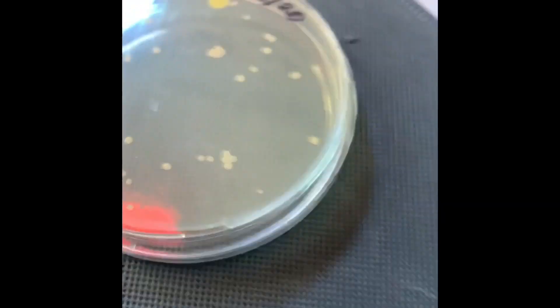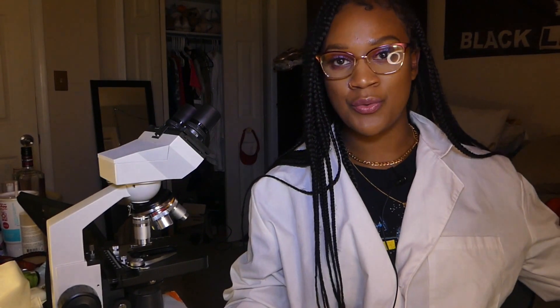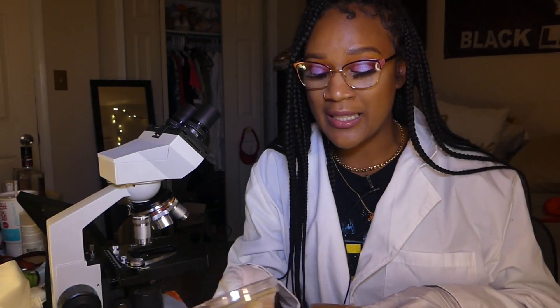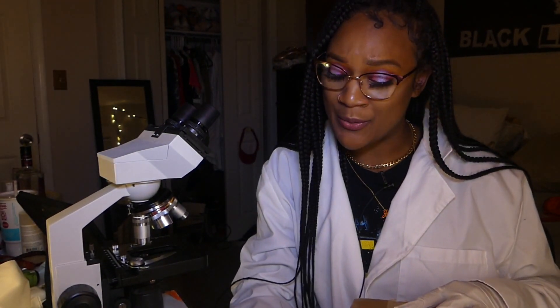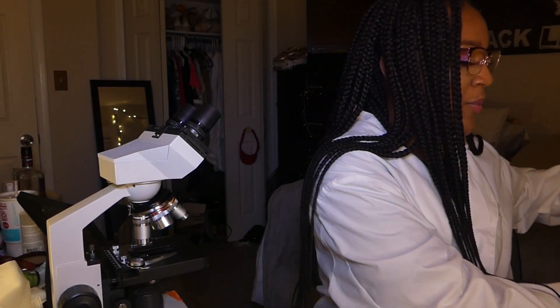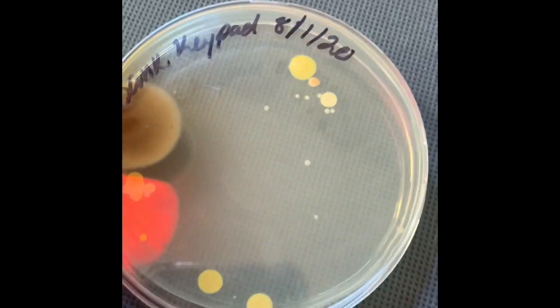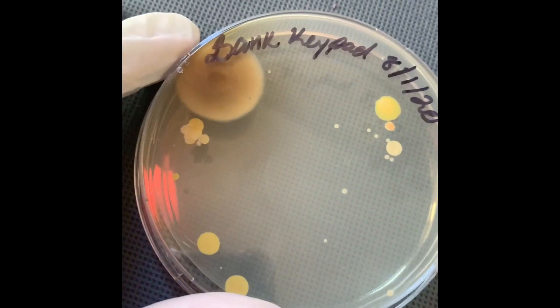Let me write down the number of colonies. I will say there is a smell coming from this box, so to protect myself and make sure I don't inhale anything, I'm going to put on a mask — which is what you should be doing during this pandemic anyway. So this is the bank keypad, sampled on the same day, August 1st.